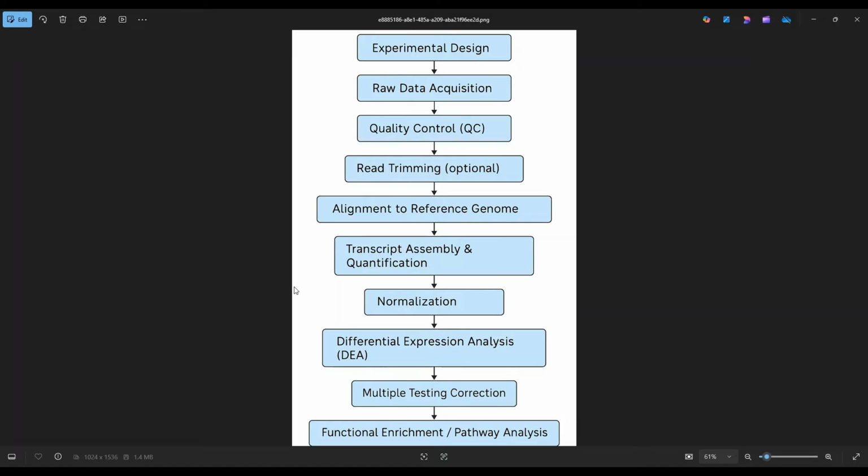So some files are publicly available and some are not. They have authorized access, but in the current world, the amount of data that has been generated is such that it's almost impossible that you cannot get the desired experimental data you are looking for on a public platform.